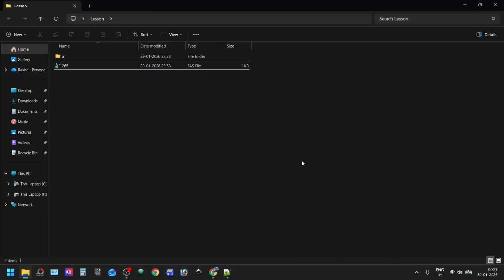I'm Tepin and today we're going to learn how to submit a protein coding gene in NCBI BankIt. Last time, lots of comments were made in my previous video about submitting protein coding sequences. So in this lesson I'm going to make it way easier than before. You don't have to do so much, you can just easily submit your sequence.